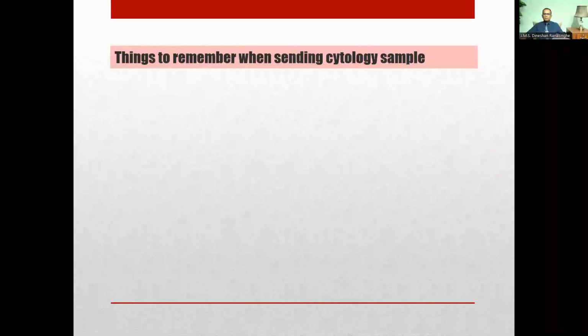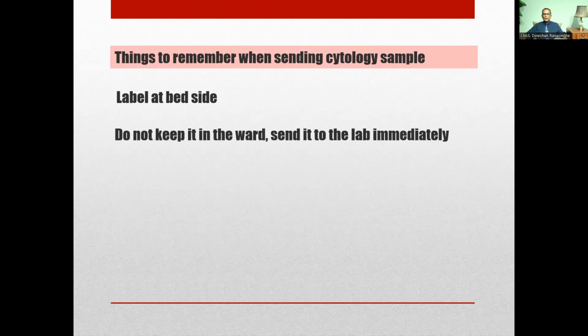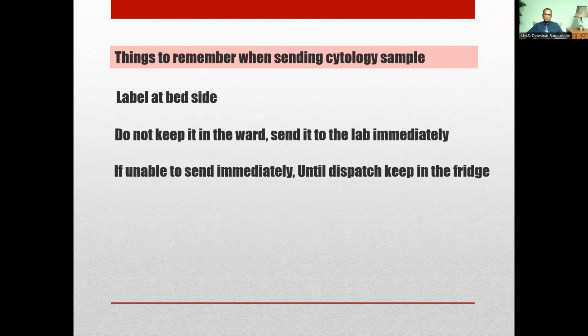And at the same time, there are things which you have to remember when sending histology and cytology samples. Label at bedside. You have to label the specimen at bedside in order to avoid all sorts of confusion. And at the same time, don't keep it in the ward, send it to the lab immediately.